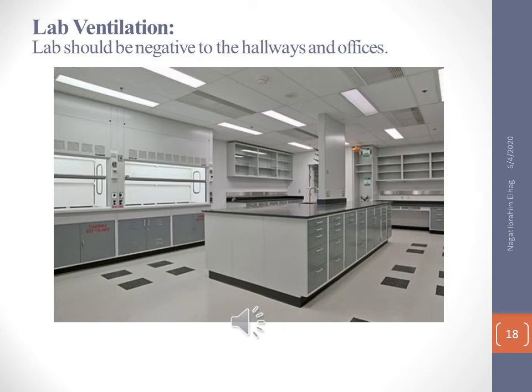As you see here, the lab is with negative air, or with a low pressure of air, to avoid any accident of broken glassware or broken chemical bottles. So you also have to be careful not to leave the doors open while you are working in your lab, to assure that the lab has negative air, to avoid any risk or hazards.